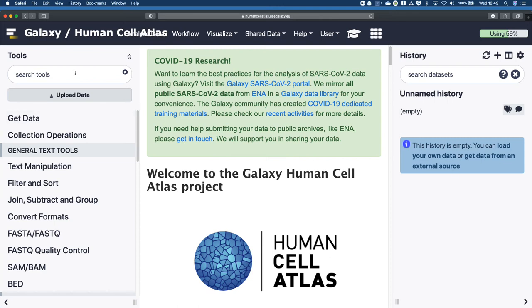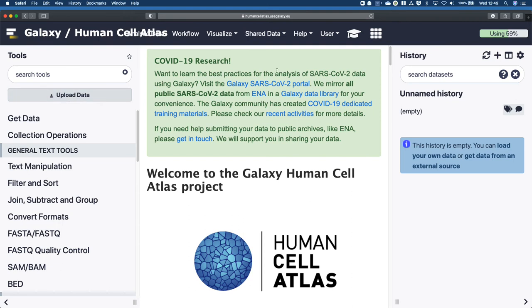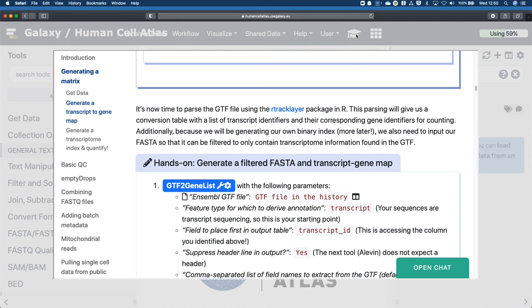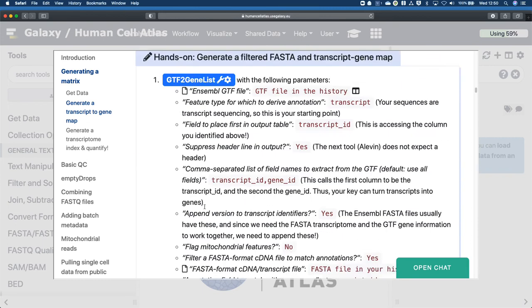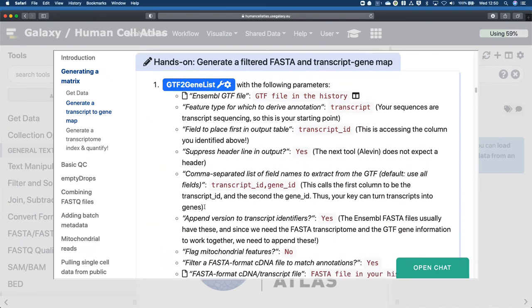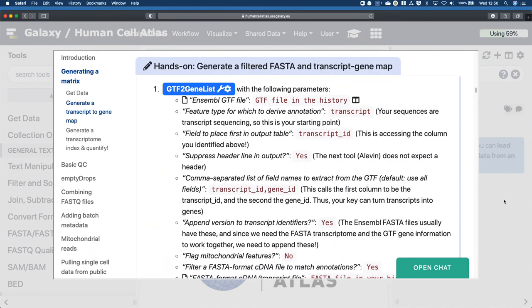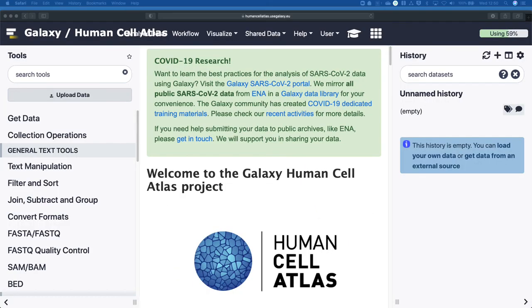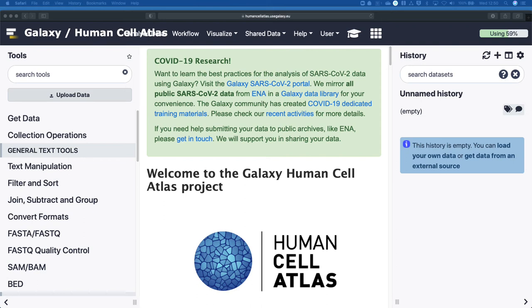It just may be a little bit trickier to find tools. So if you ever get stuck because it's not coming up when you search tool and you're not using the Human Cell Atlas instance, go through the little gorgeous graduation cap here, and then you'll be able to click on the tools directly in the tutorial. So if you ever get stuck that's your get out of jail free card. The other thing to note is this screencast is all about helping you navigate Galaxy. All of the important scientific information is within the tutorial. This is purely for if you get stuck. Right, onwards with the tutorial.